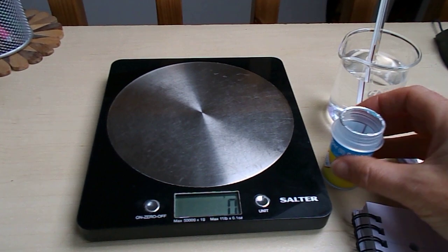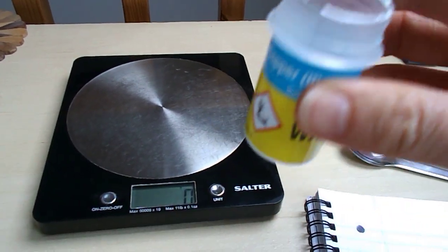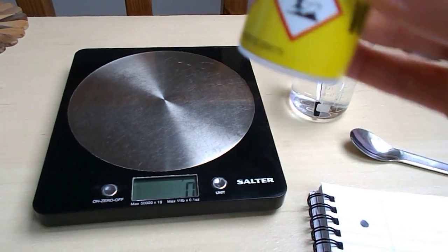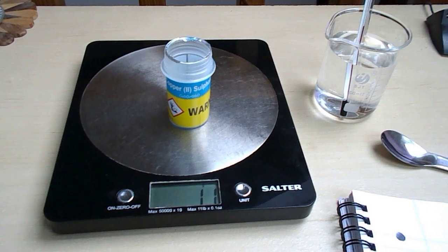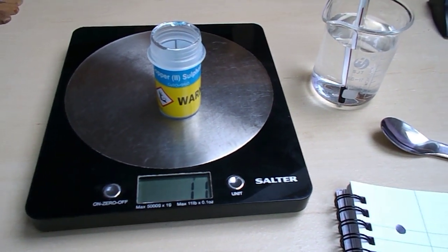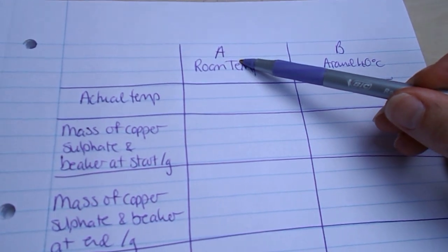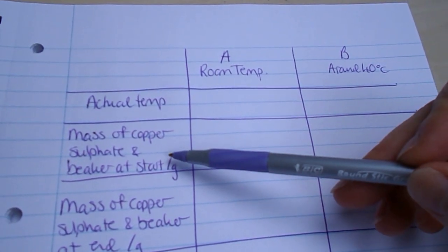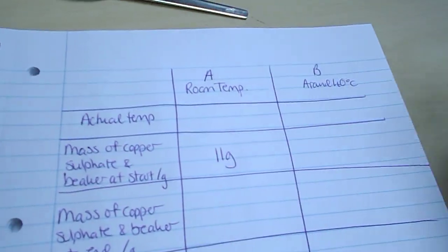So we need to know how much copper sulphate, a blue powder, we've got in there. So we're going to weigh the beaker, the container it's in, and the copper sulphate. So that is weighing 11 grams. So on the results table, for room temperature, I'm going to record the mass of the copper sulphate in the beaker at the start. So that was 11 grams.